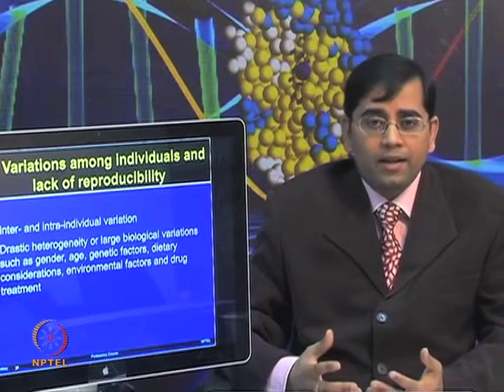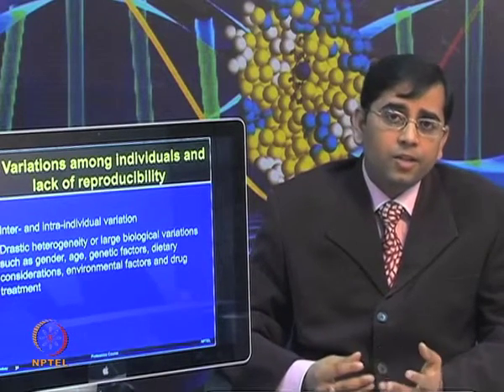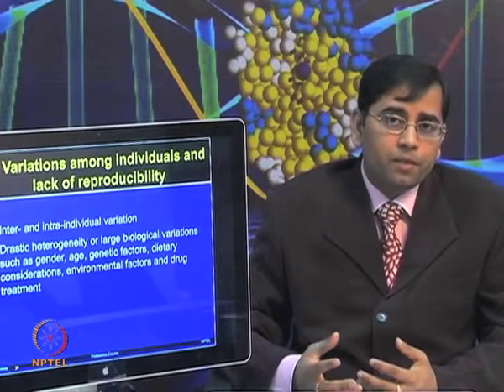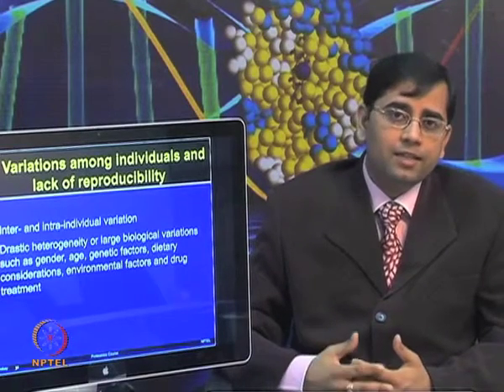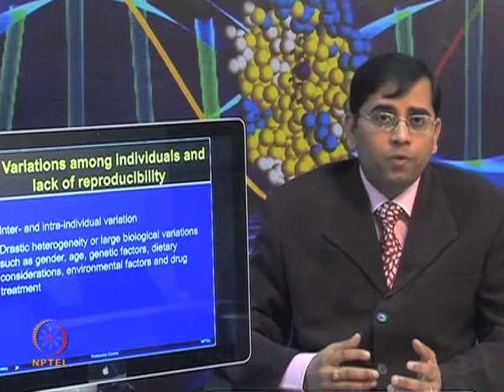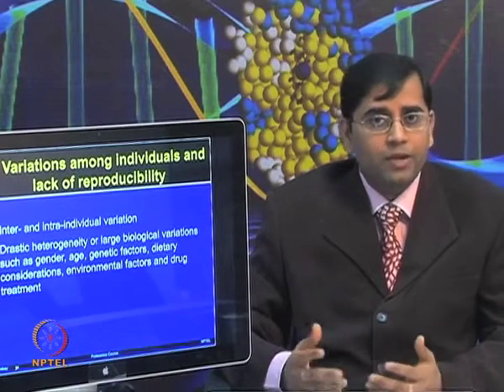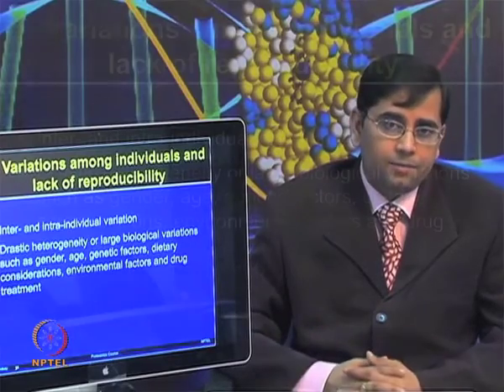So, how do we avoid these inter- and intra-individual variations? If you refer to the previous lecture, where we talked about how to minimize the factors that ensure the success of clinical studies, you will be able to keep an eye on different extrinsic and intrinsic influences, which one should try to remove as much as possible during clinical proteomic analysis.